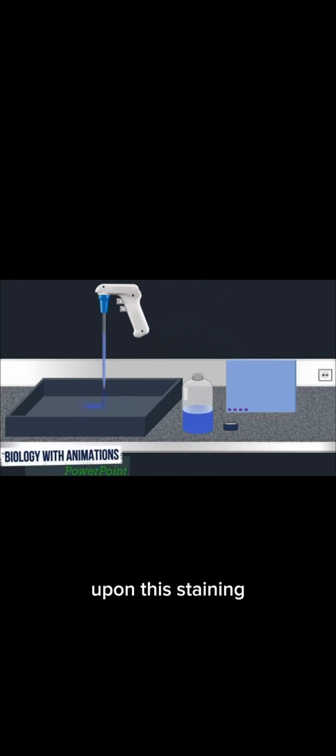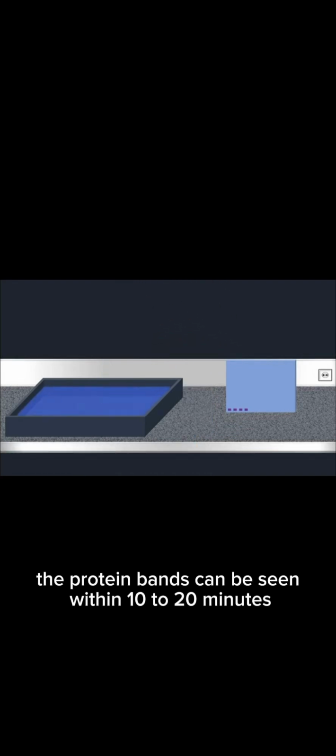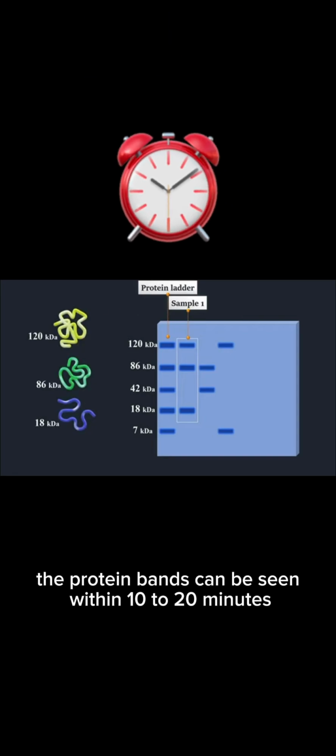After removing the glass plate, the stacking gel is discarded and the separating gel is stained. Proteins are detected as blue bands in the background. Upon this staining, the protein bands can be seen within 10 to 20 minutes.